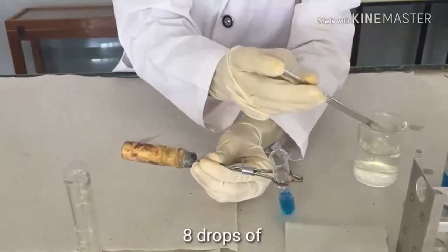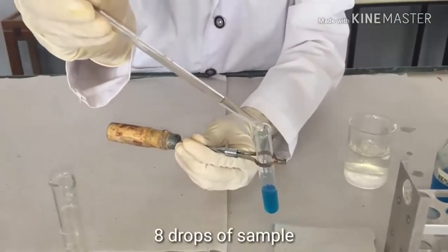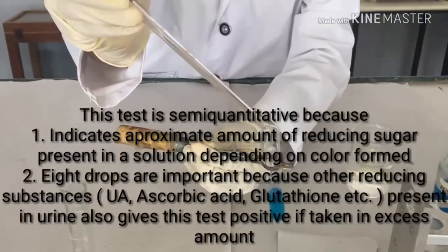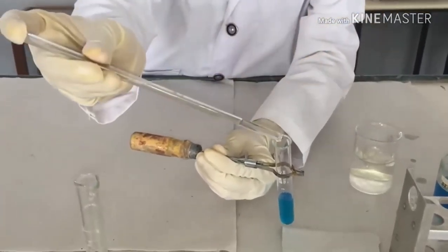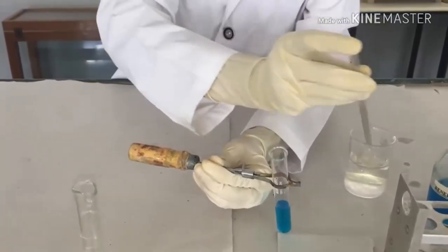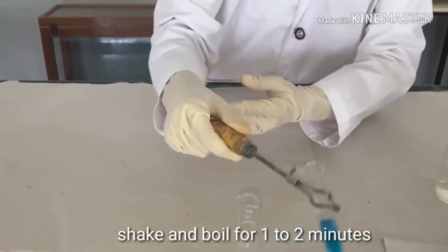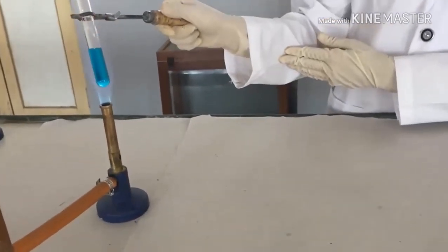Add 8 drops of the sample. Shake the contents well and boil it for approximately 1 minute.